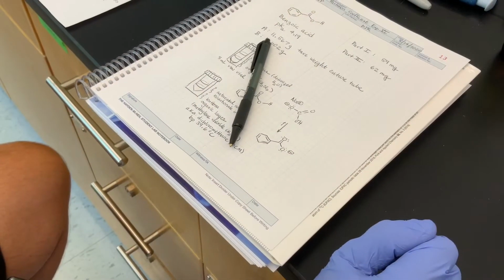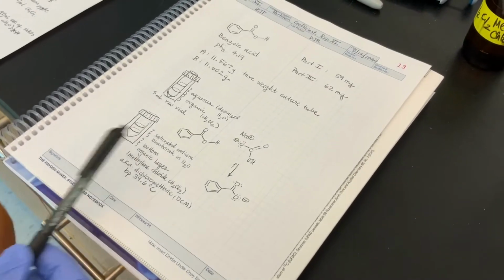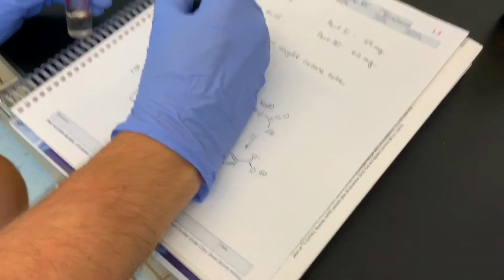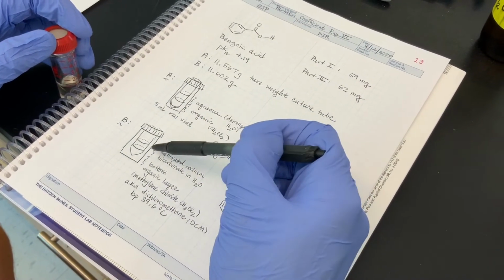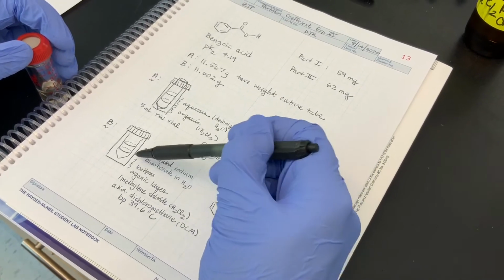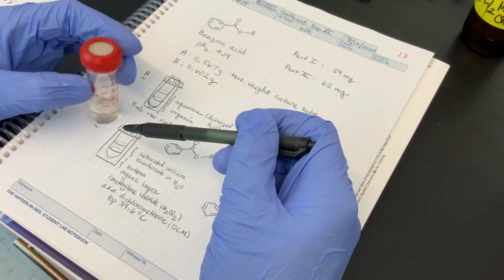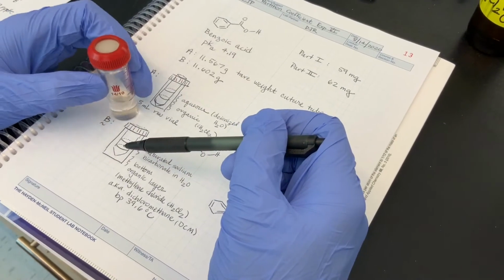Okay, we've almost completed part A, and now we're on to part B. These are just some crude drawings here. Part B, the reaction vial: rather than deionized water, we're going to use a saturated solution of sodium bicarbonate. As of right now, we still have the bottom organic layer, and at this point that larger chunk of benzoic acid has completely dissolved.